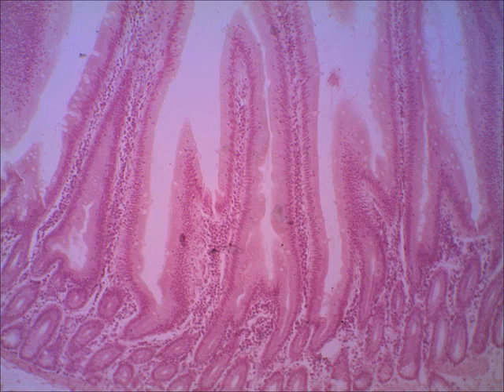On the next slide, if it will move on, here it is. You see on now, instead of scanning, you see this on low power. You can easily see the villi. There's a villus, there's a villus, there's a villus, there's a villus. And then down here, deep in the mucosa, you see crypts of Lieberkühn.